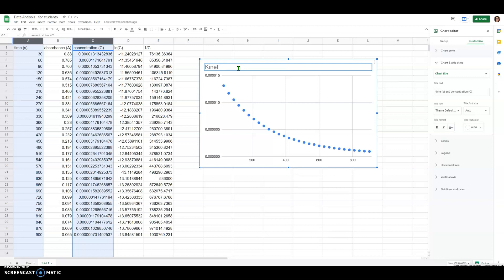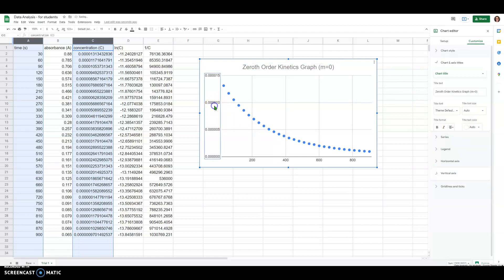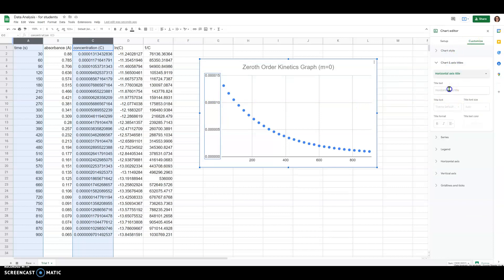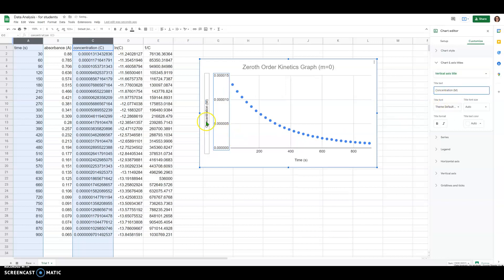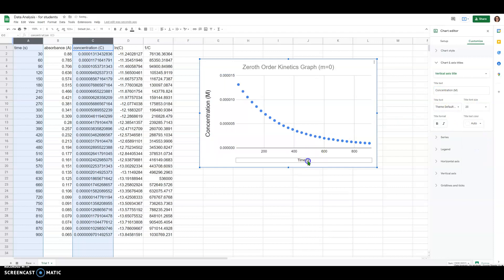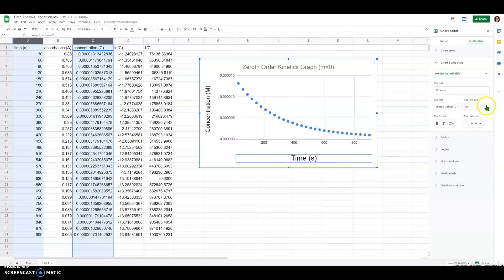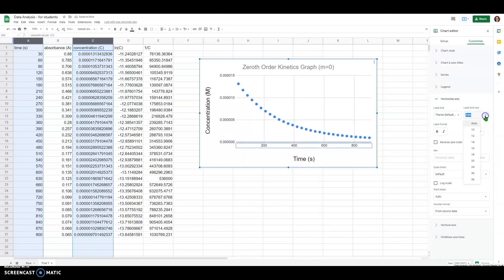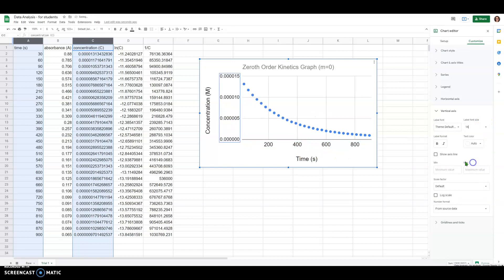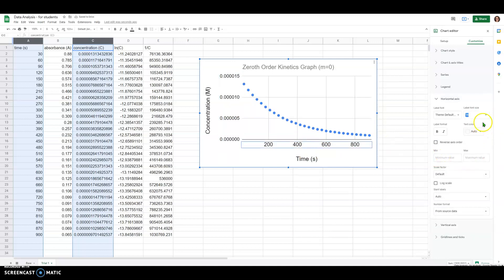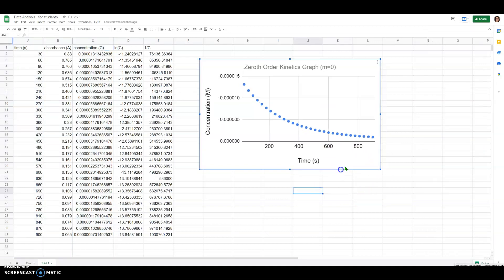I'll call this the zeroth order kinetics graph, where M equals zero, and center the title. Add axes titles: the horizontal axis is time in seconds, and the vertical axis is concentration in molarity. I'll also increase the font size a bit — let's change those font sizes — and make the tick mark labels one or two font sizes smaller than the axis labels.